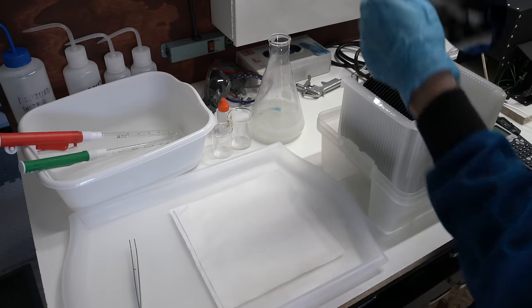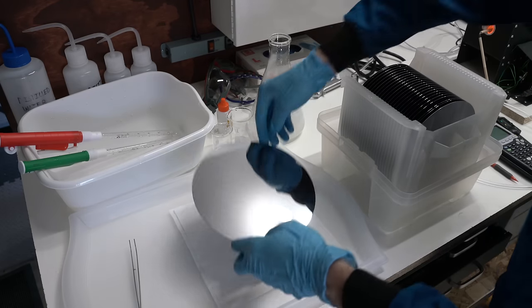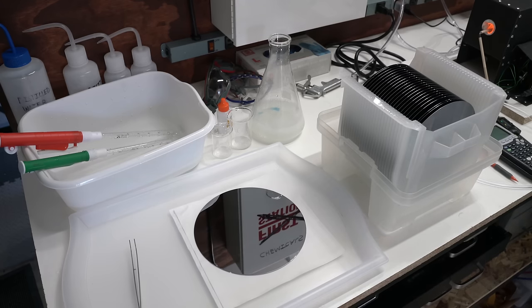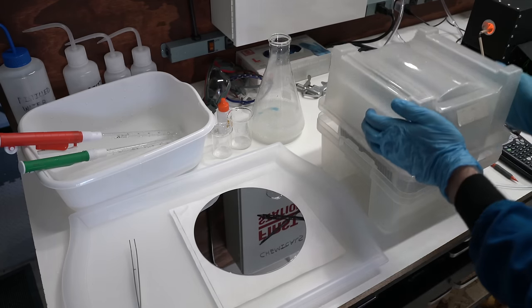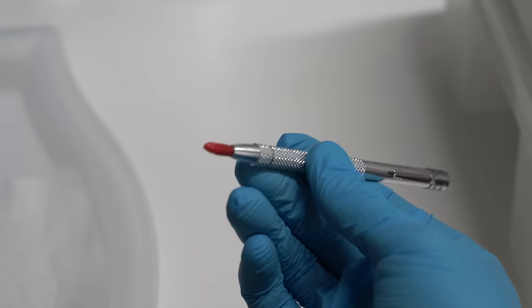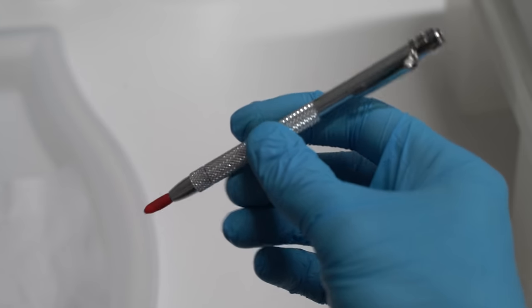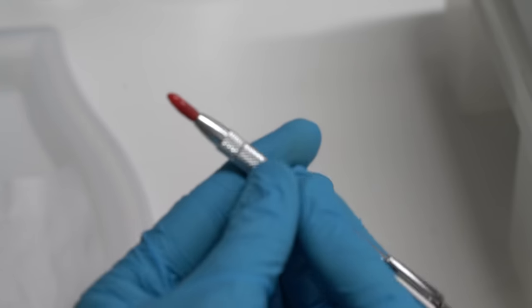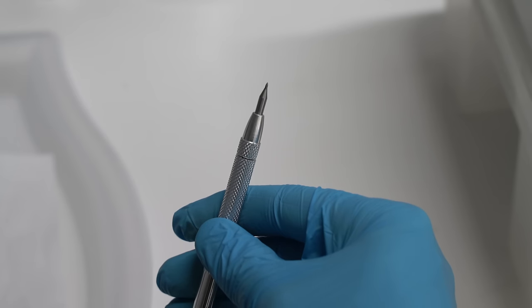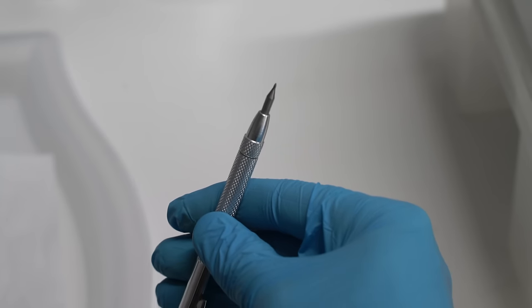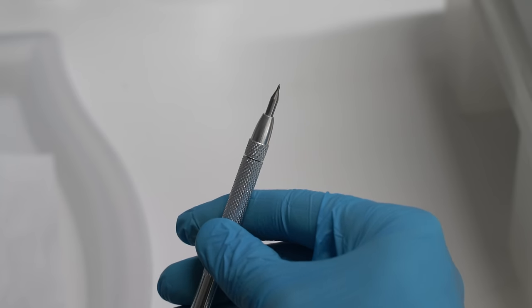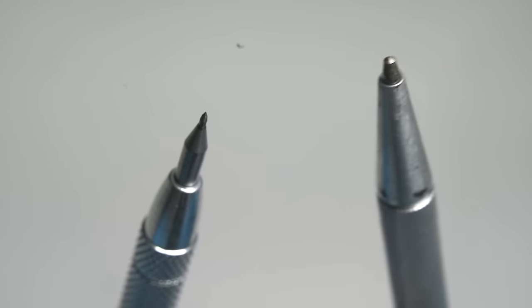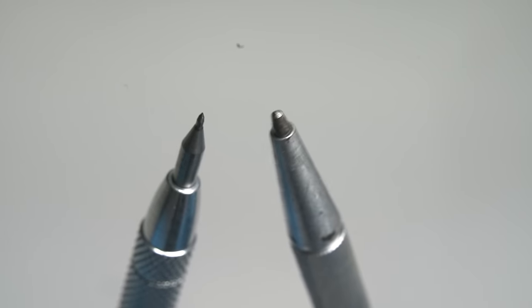Now, these wafers are obviously not going to fit in our tiny furnace. We're going to need some way of cutting the wafer up into manageable pieces. Fortunately, all we need to accomplish that task is this tool. It's called a scribe, and it's essentially just a pen with a really hard sharp point. The tip on this is tungsten carbide, and this one is diamond.